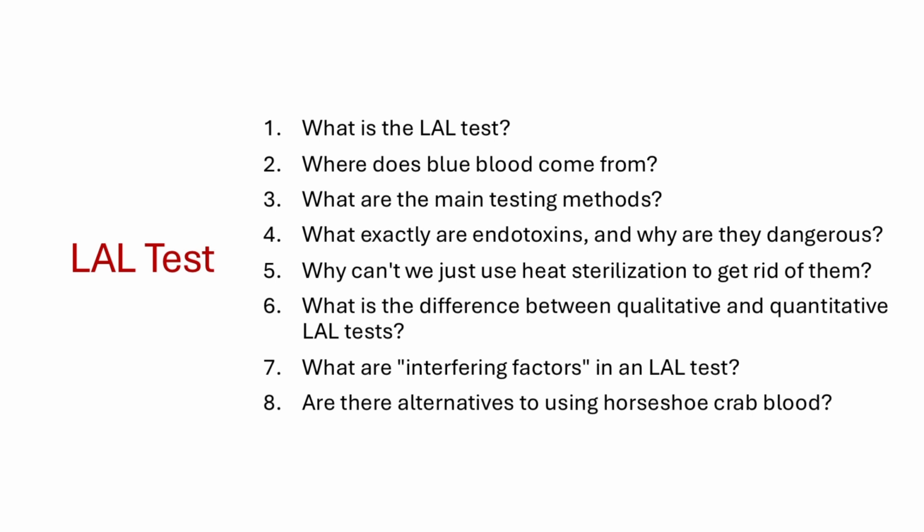Today we will learn about LAL test. Let's quickly go through what we will learn today from this lecture.